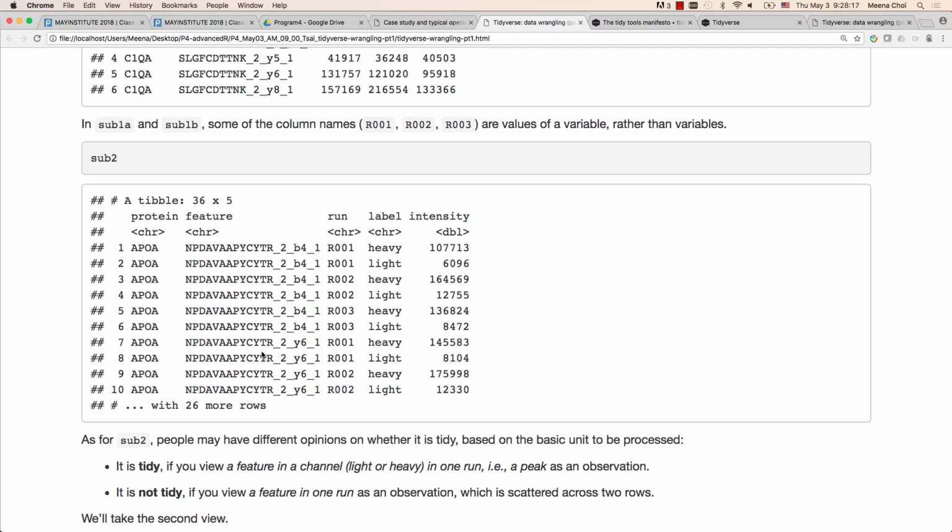Right. Yes. So then with fragmentation, like you said, would you want to go wide or would you want to go down? Yeah, so if you want to organize your data in a tidy format, then you want to have a tall format. Is it called tall? Yeah. But if I want now to extract the information of the B4 ion across all runs, how can I do it there? Because I would just leave away the entries in the runs where I did not find the B4 ions. Yeah. Missing values for that. Hold on that question for one second, and we'll get to that very quickly.